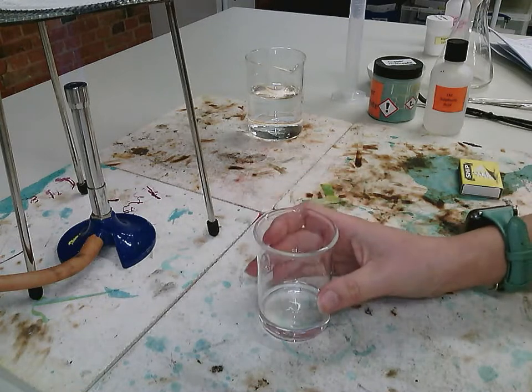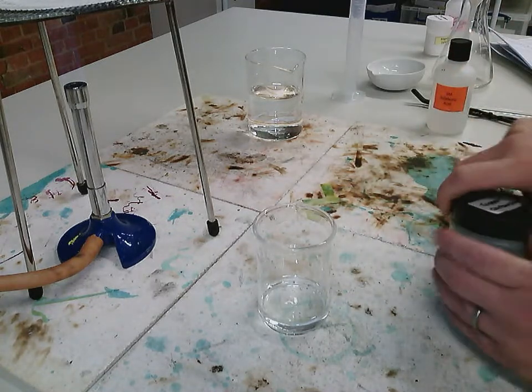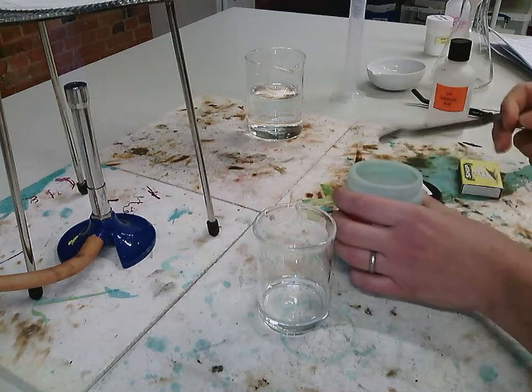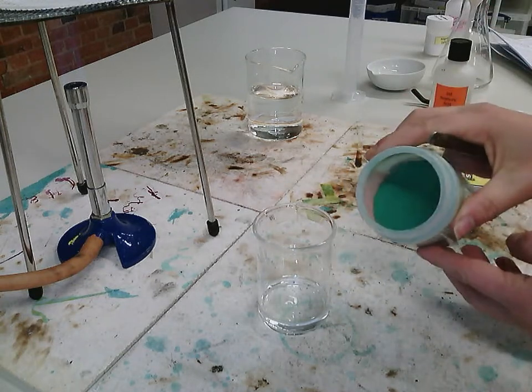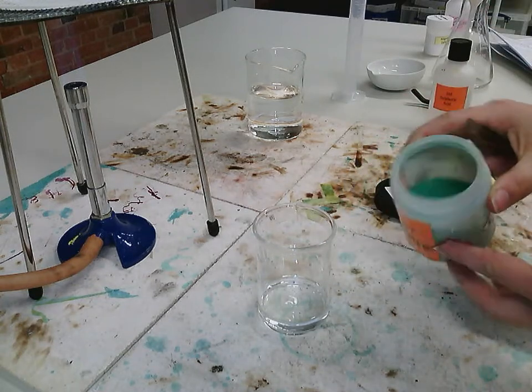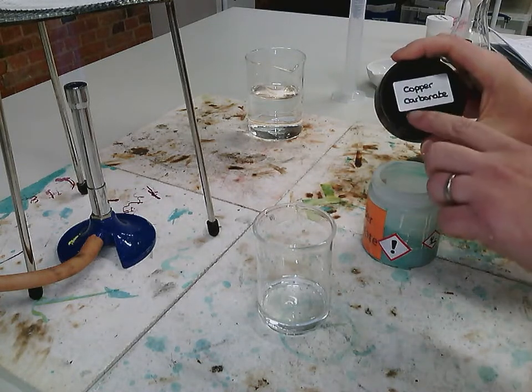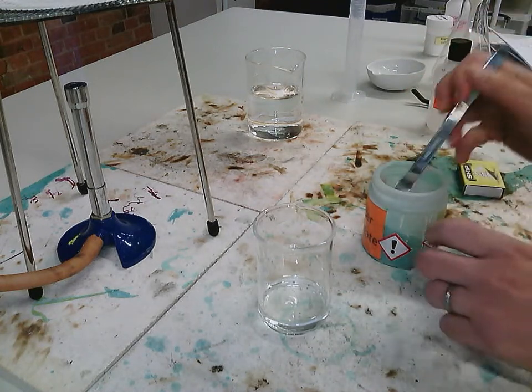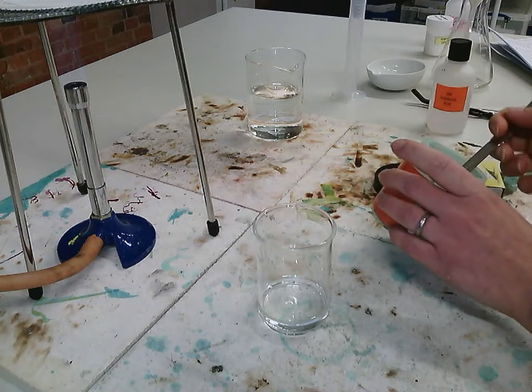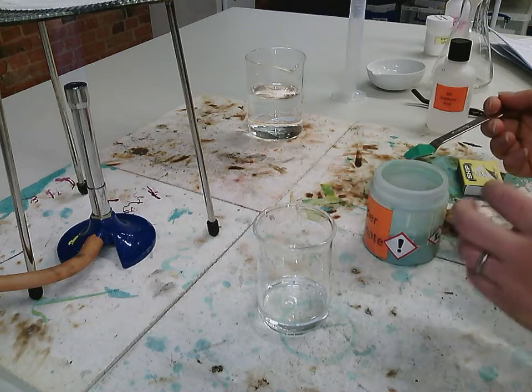Now the first thing I need to do with this is I need to react it until all the acid has gone. So the way I'm going to do that is I'm going to add in the copper carbonate, and what will happen is the copper will form copper sulfate, so it will go from this lovely green colour, which is copper carbonate, to a blue colour. And what else will happen is the carbonate will release carbon, which will react with the oxygen in the acid, and it will form carbon dioxide gas. So what we'll get is carbon dioxide gas and water and copper sulfate.